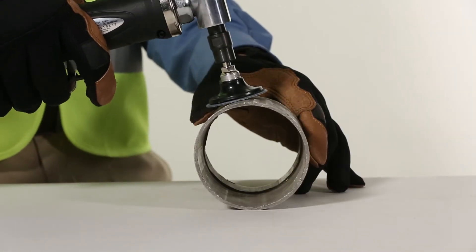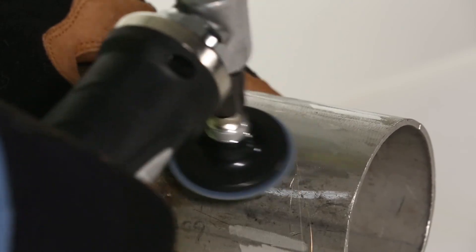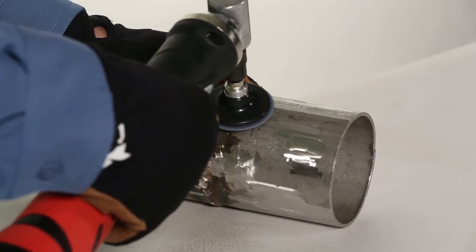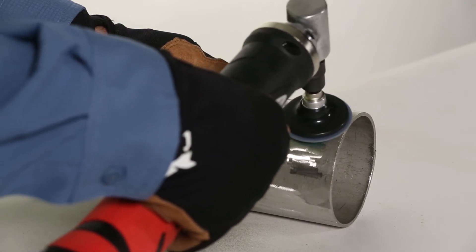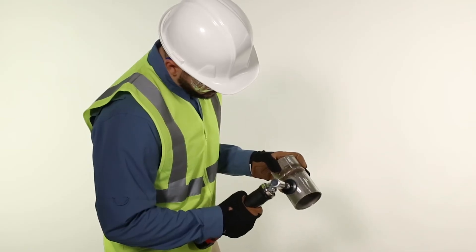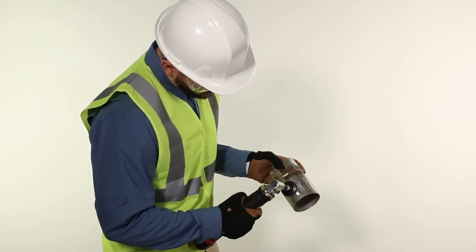Grind the sample by working the sanding disc near parallel to the surface to avoid dishing. Move the grinder in one direction so as not to cross-contaminate the fresh surface. Avoid using excess force and maintain control of the grinder to prevent removal of excess material.